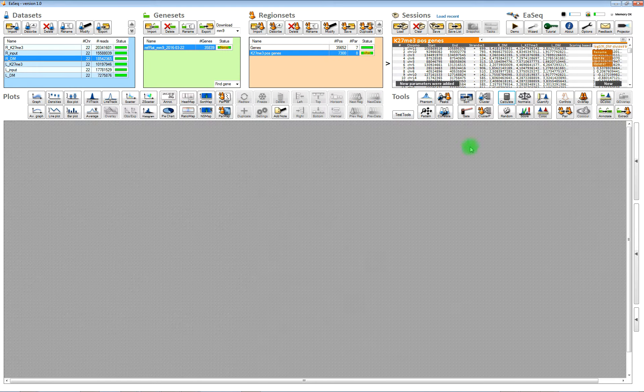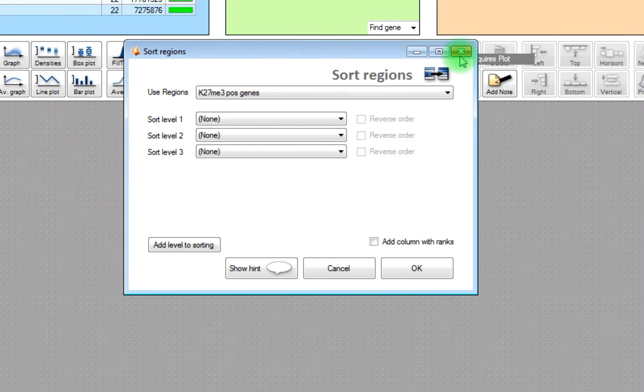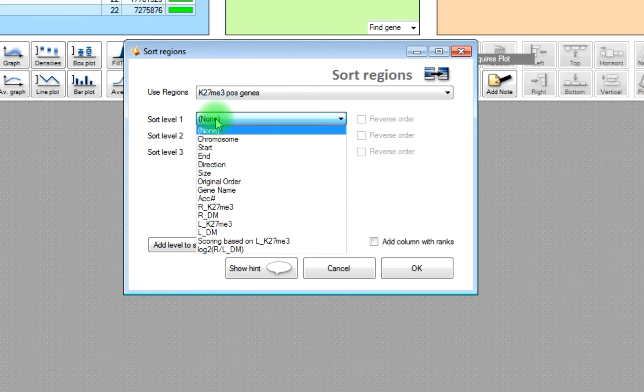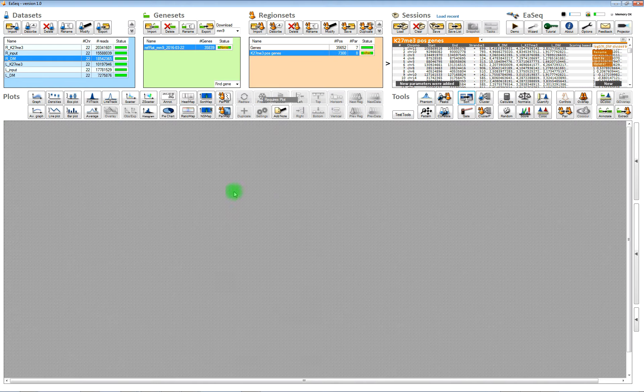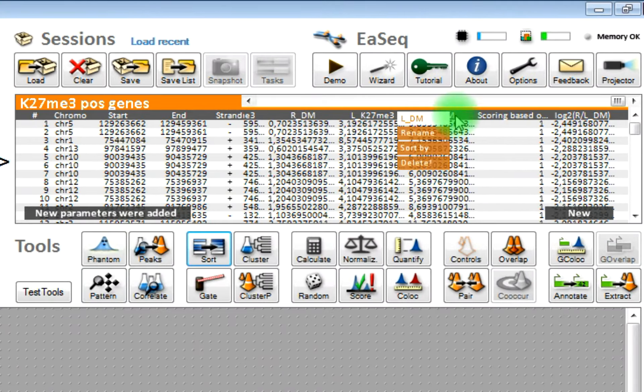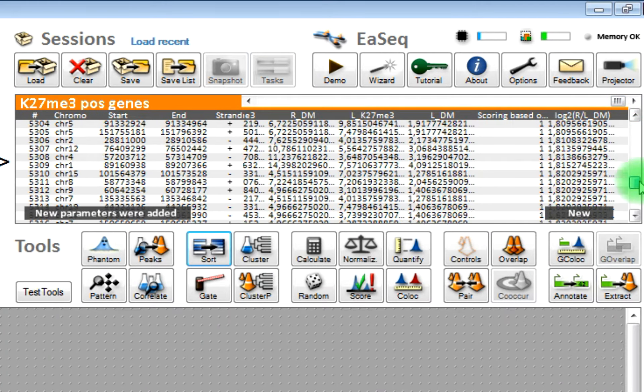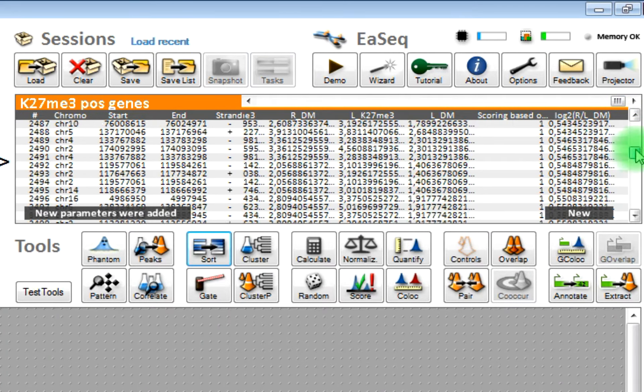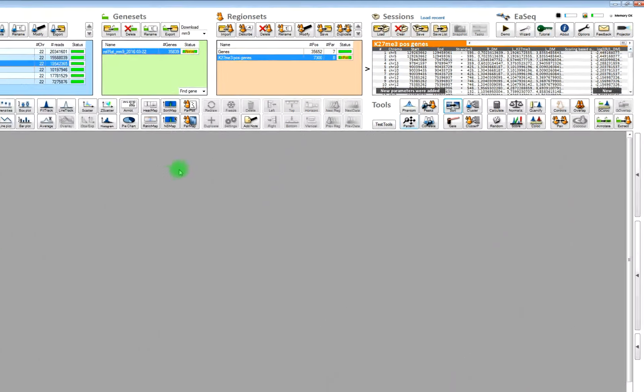Then now that we have calculated the log twofold difference, then we can use that to sort the regions. Now they have changed the order. You can see that we have low values in the top of the list and high values in the bottom.